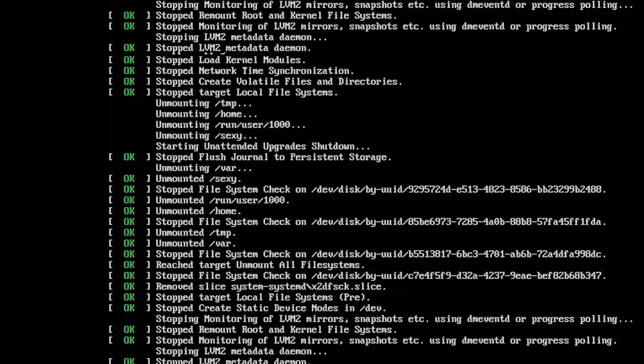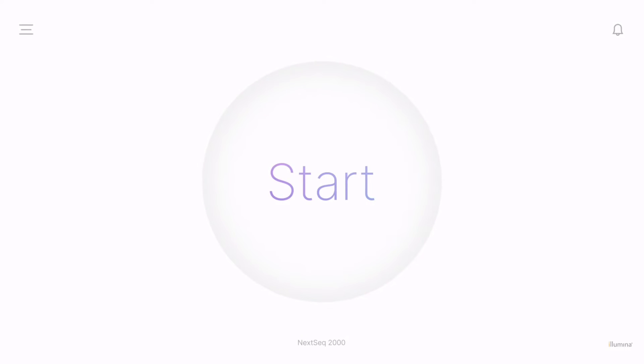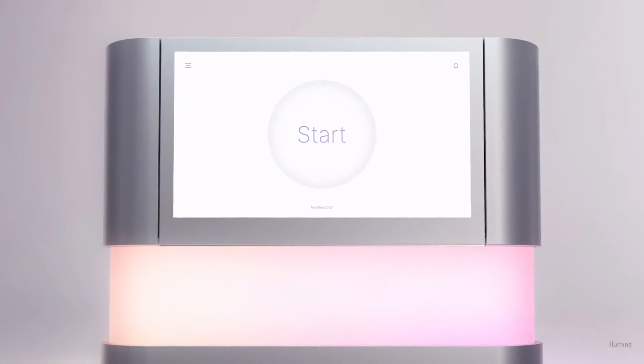After scripts are complete, the control software is launched and initializes the system. Wait about 5 minutes for system initialization. The home screen appears when initialization is complete.